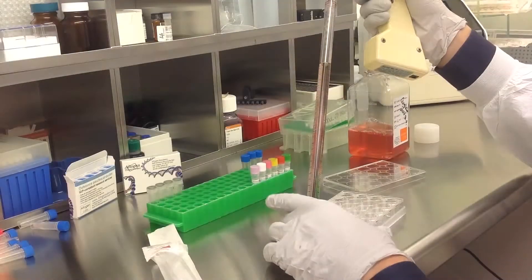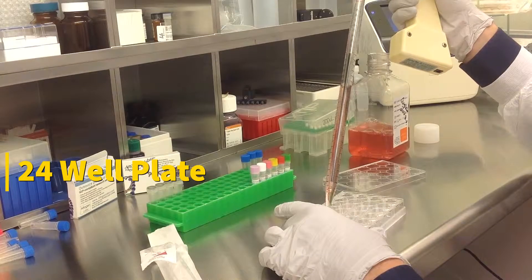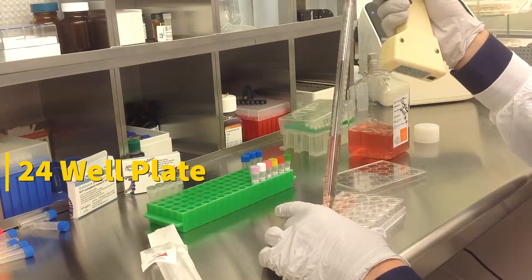Today we will be transfecting HEK293 cells obtained from ATCC using a transfection kit manufactured by Altagen BioSystems. In this tutorial, we use a 24-well plate. Transfections can be scaled up or down based on plate surface area as described in the corresponding transfection protocol, which can be found at altagen.com.